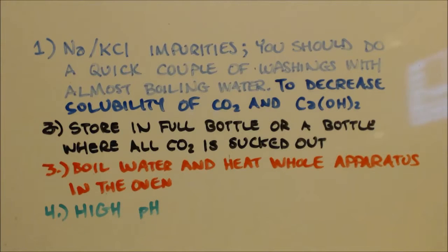You should put some more boiling hot water through your hydroxide while you're filtering it to wash off some of that table salt that's on there. I didn't do it because I just wanted to see if it was even possible to make a hydroxide. Like, how fast does that CO2 come in and screw it all up? So I did it once just to make sure that it can be done.